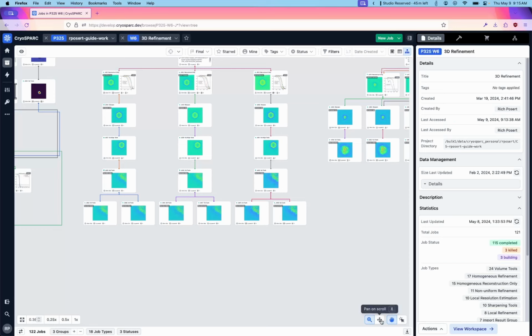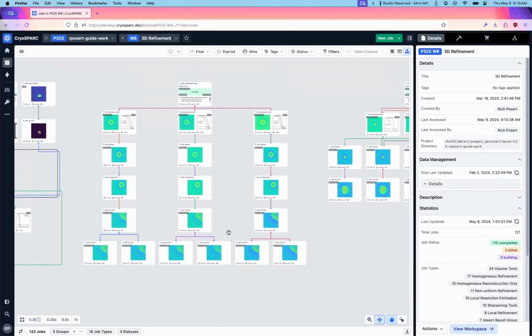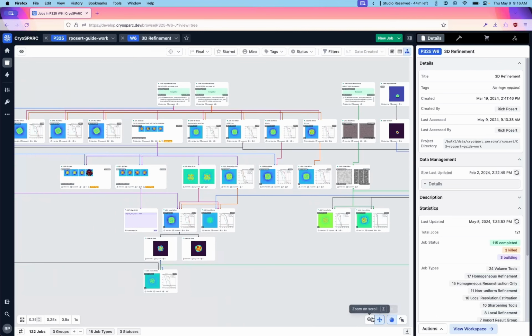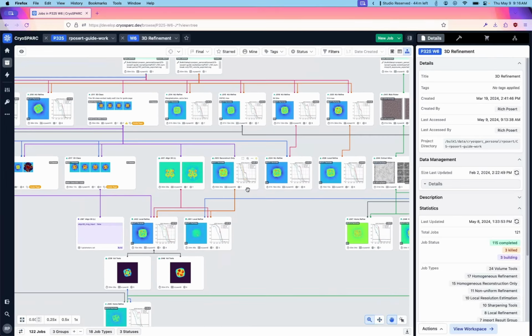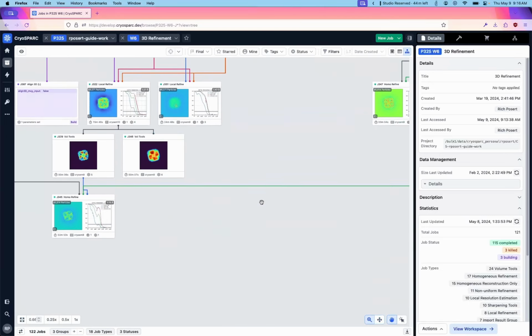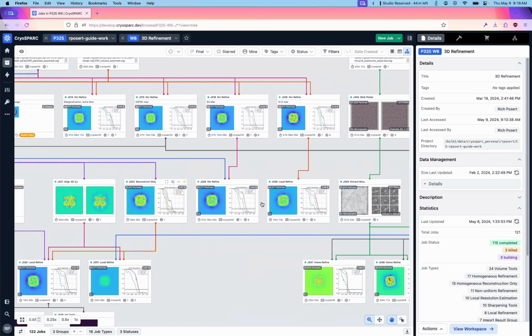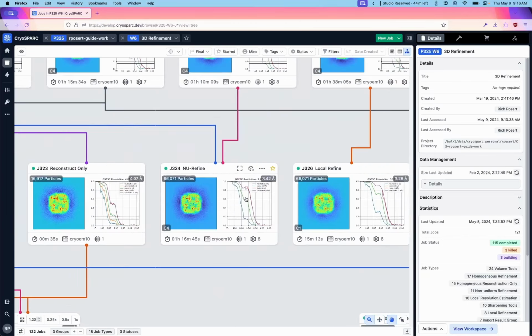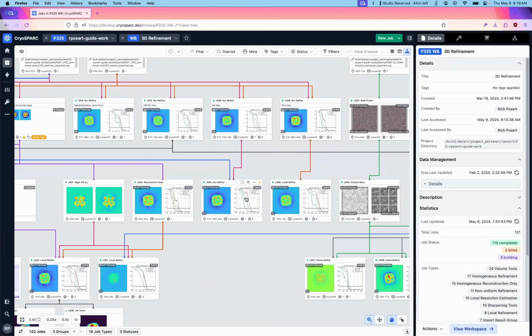Scrolling has another functionality, which is panning. So I've clicked this button down here, and now when I scroll, I'm panning up and down. I can hold Shift to pan left and right, and I can use the keyboard shortcuts to switch between these two modes. I can press Z to change back to zooming, and then I can press X to change back to panning. Also, if I want to temporarily switch modes, I can hold the Command key. So right now I'm zooming, and then if I hold Command, I'm panning. So Command Shift would change me to panning left and right. But you'll note that I never changed the mode down here. So if I let go of Command, I am again zooming in and out.